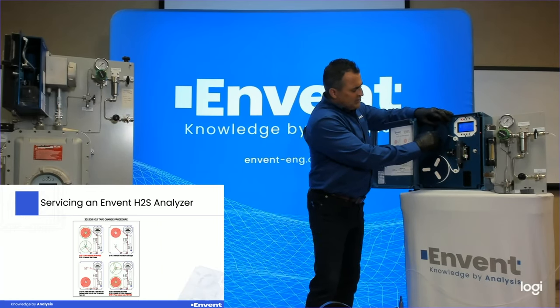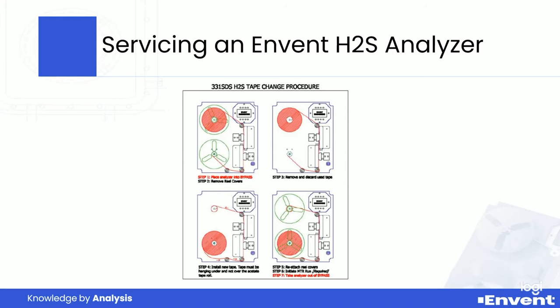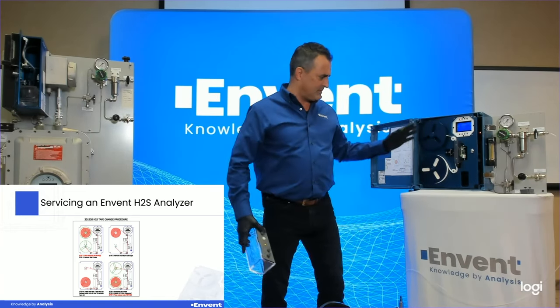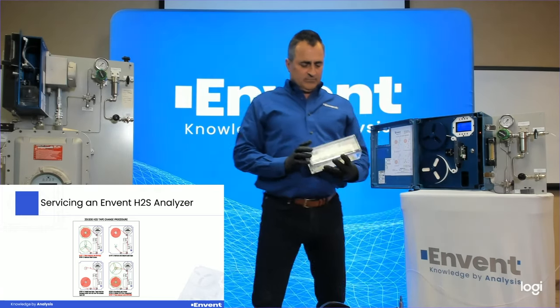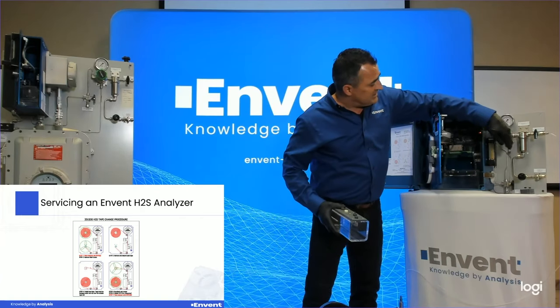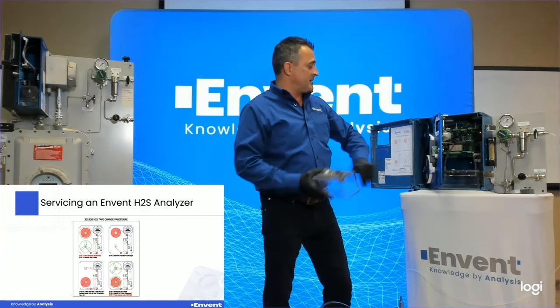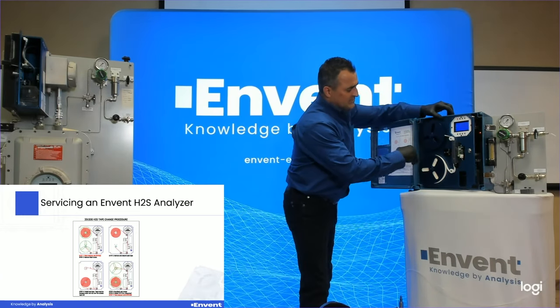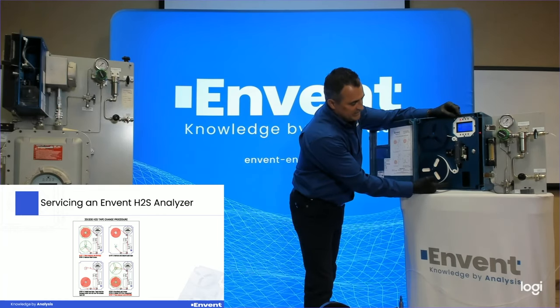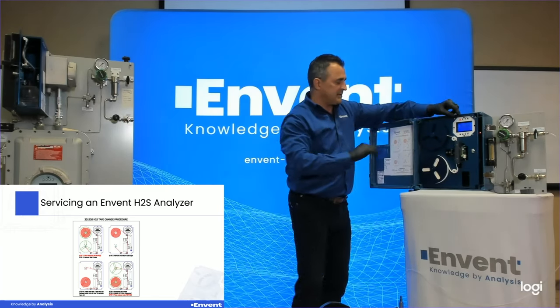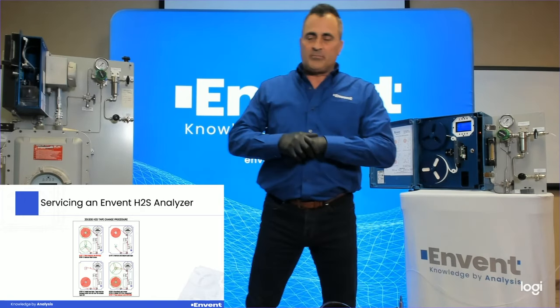On the dual sensor, you route the tape the other way. Our dual-sensor H2S analyzer — which could also be H2S total sulfur — measures two streams simultaneously on one tape. One sensor block looks at one side of the tape, one looks at the other side simultaneously. We have two humidified streams coming through the humidifier, two separate flow meters, two sensor blocks. We can't route the tape over the top on that model due to spacing, so we use an extra wheel to roll it the other way, preventing the tape from dropping near the door.